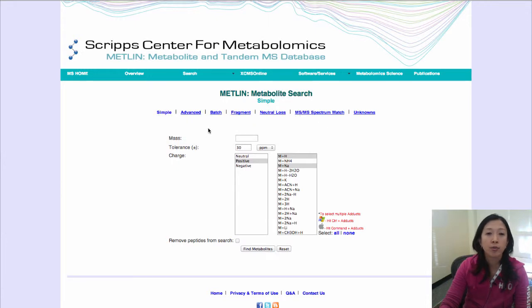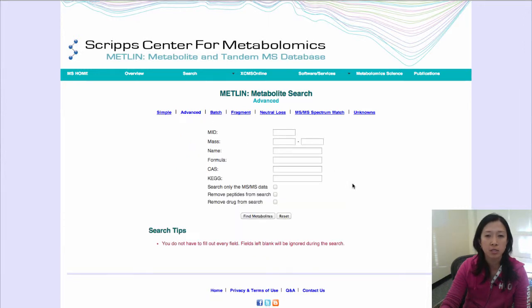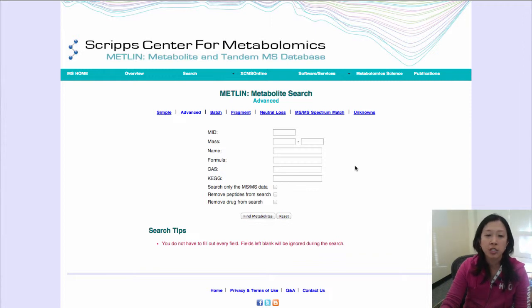Or if you would like to search for a known compound, you can simply go to Advanced Search. Over here, you can type in any information you have, and you don't have to fill in everything. Please keep in mind that each chemical has many scientific names, so if you type in a name and you didn't get any hit, please don't give up. You can either use the formula or CAS number instead.